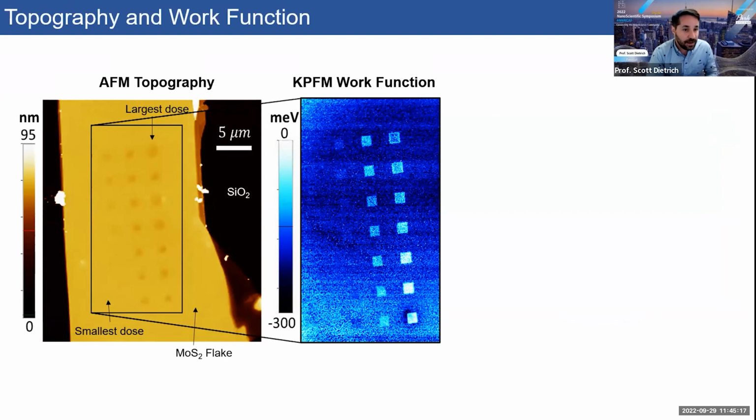If it was happening in the MoS2, we would expect some sort of change in the interlayer interactions, which we didn't think would happen by just a layer sliding. We didn't have some major atomic reconstruction that we suspected. And we also saw that the work function evolved in a non-monotonic way, which might be expected.